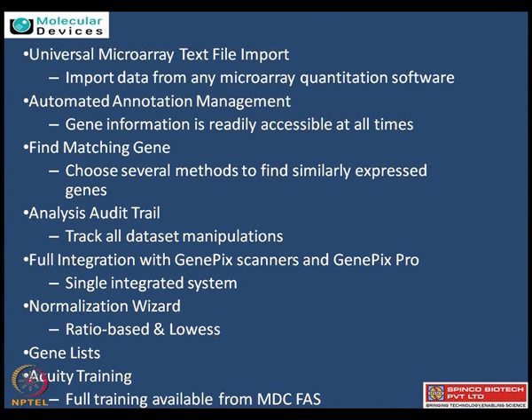It can also take other formats, even text format, wherein you need to give information on what each column means, and then again you can perform the same statistics. So there is an automation management also possible with this. You have a number of slides coming in every time, so you do an experiment and add on some more. So there is a possibility that you can add to your present experiment itself, right, which gives a very good opportunity so that you need not repeat over and over to understand what is happening.